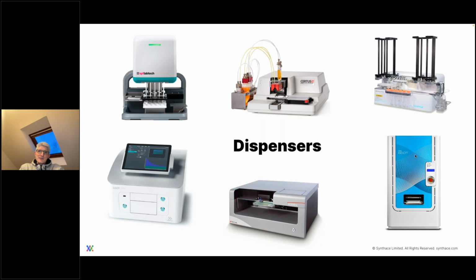So what that means is there's no need to eject tips if there are tips on the system. And so it means that you can just have a very rapid dispensing of a large number of different liquids into your destination plate without having to worry about consumables usage to the same degree at all, and also at a much faster pace.